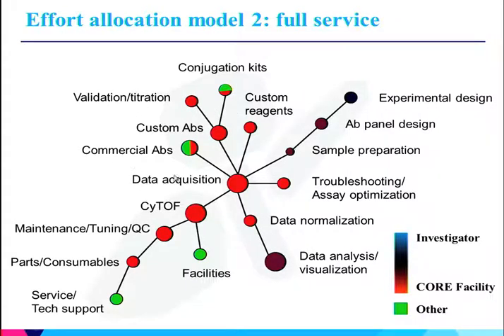And a key element of this was, we started off small with things that were admittedly largely familiar to me because I'm an immunologist, so it was a very immunology-focused development. But as time went on, we also supplemented this with a large number of custom antibodies, which were much more on a per-request basis for individual investigators' projects. And rather than have those antibodies be specific to one investigator's project, we took all of them and added them to the central pool to continually grow the repository. And I really feel that the utility of the resource is almost directly linked to the size and validity of the reagents available.